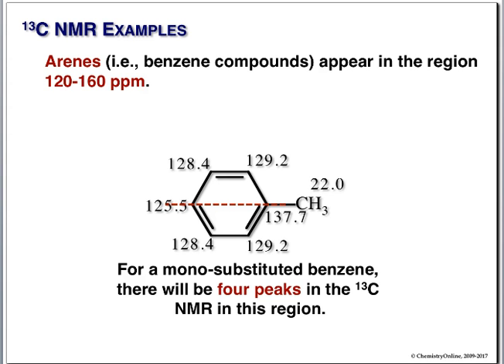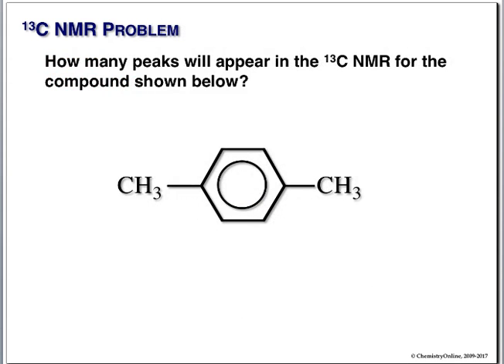So let's play the game again. How many unique peaks will we get in the arene region for this guy? Look for symmetry.